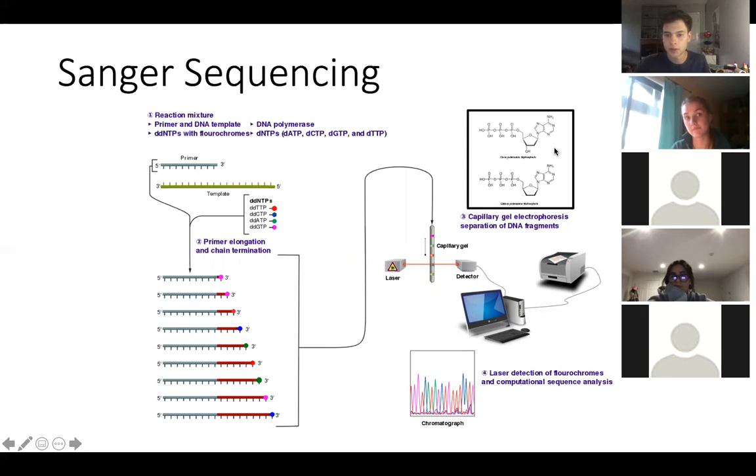And you can see it up here, I believe. Not that chemical modification really matters for our purposes, but what it results in is that the new DNA strand being synthesized is terminated. So because there's a chemical change on the ddNTP, the next nucleotide cannot be added, and the full strand will not be made, and it'll be cut off short.